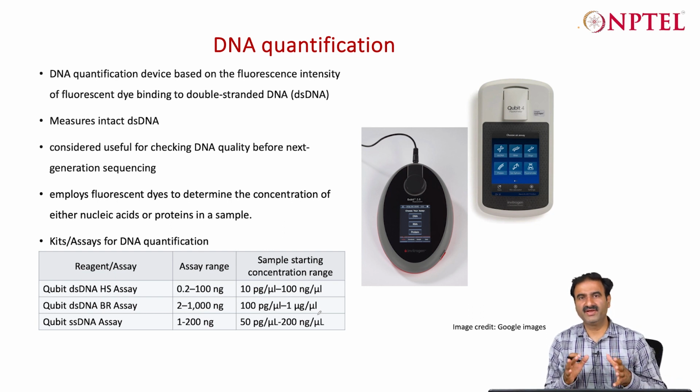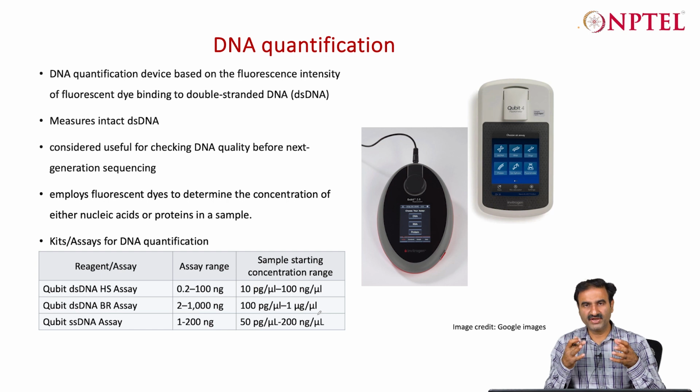You should have surplus DNA, so that after your sequencing job, species identification and other molecular biology experiments are done, you still have sufficient DNA in stock, stored properly so that you can use it later. This also remains as evidence of the DNA that you have extracted, for future validation, which will be very much needed.